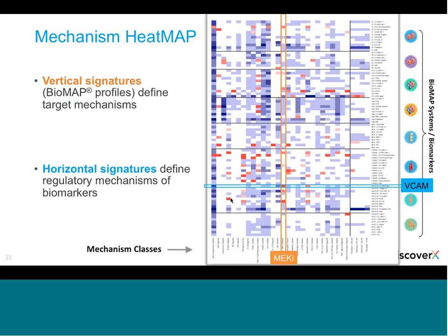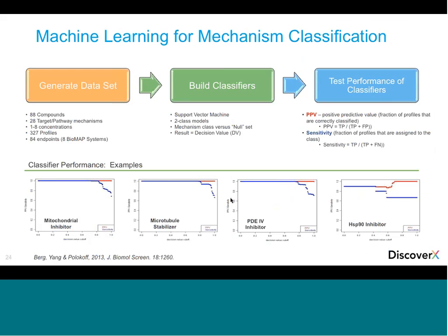Here is how VCAM in our fibroblast model system of wound healing is regulated by all of these pathway mechanisms. So it's a very, very rich plot, and one can do a deep dive in inspecting the test compound activities and how it compares to all of these pathway mechanisms that are shown here. A lot of biology in a very efficient format.